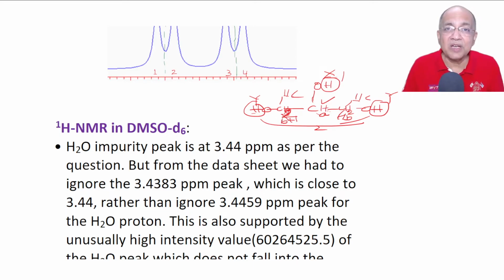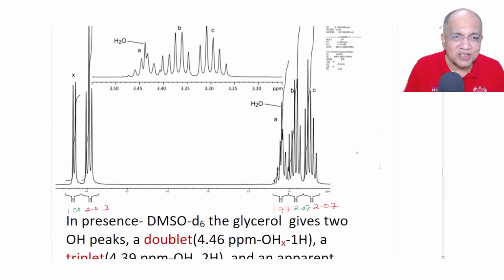Here the only difference is the OH peak will be available, and also the OH will be able to couple with the neighboring protons, and itself being coupled by the neighboring protons. Right now I have given you this data.